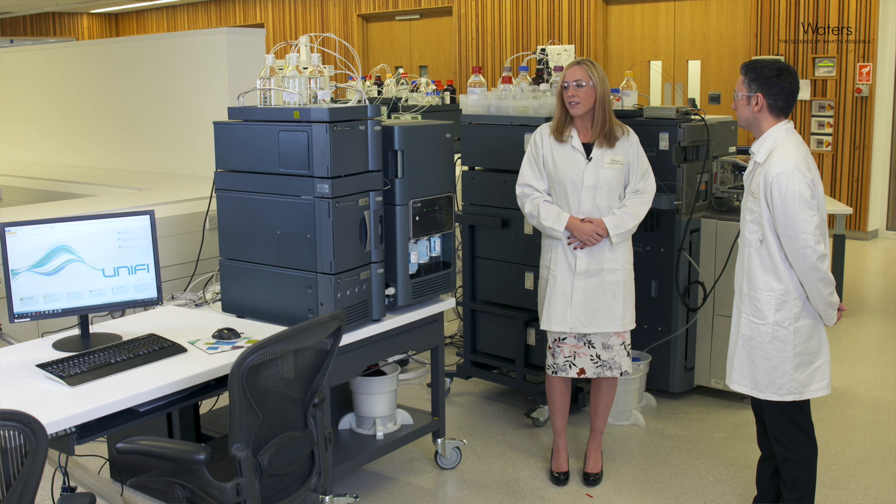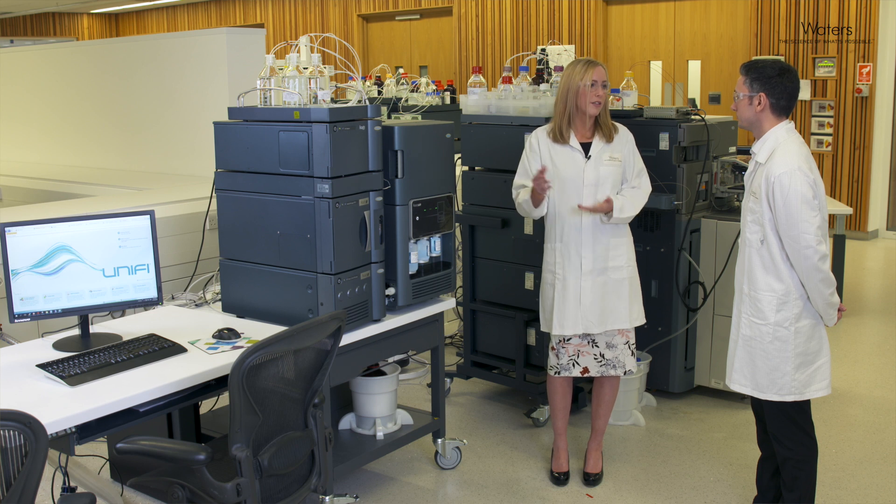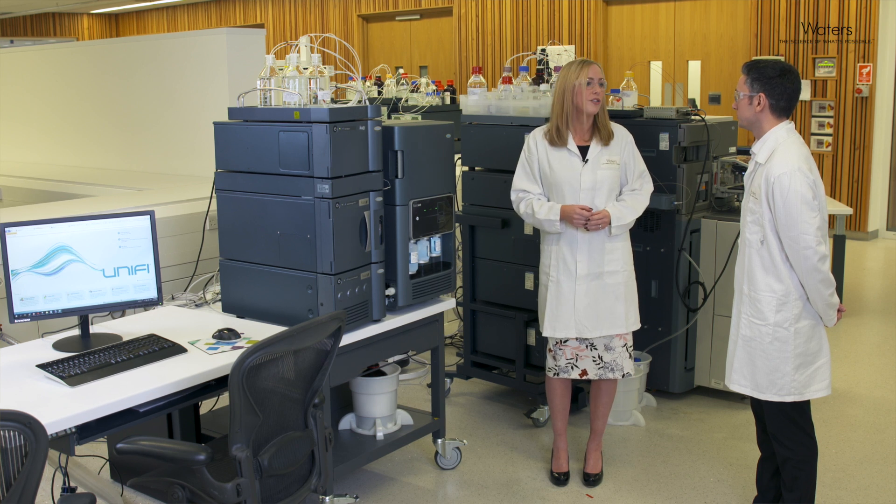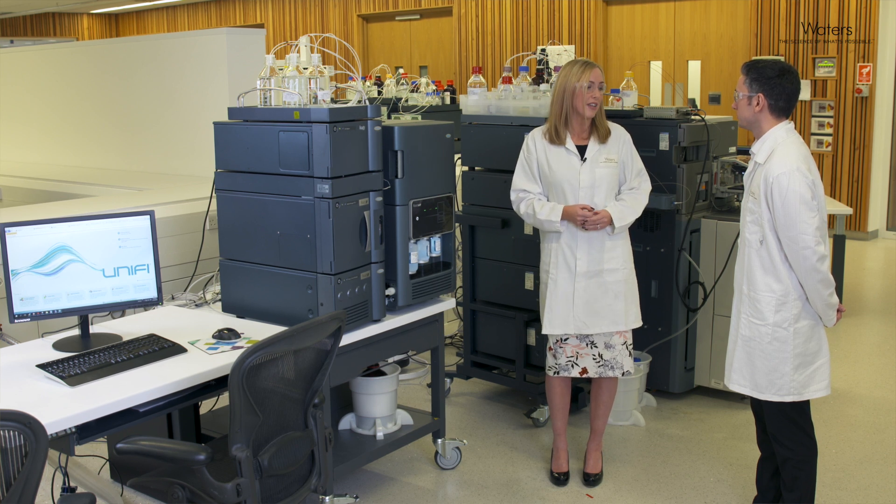How easy is it for a user to get the system ready to acquire data? Okay, so if you'd like to come back to the computer with me and I'll show you how to do a system setup.